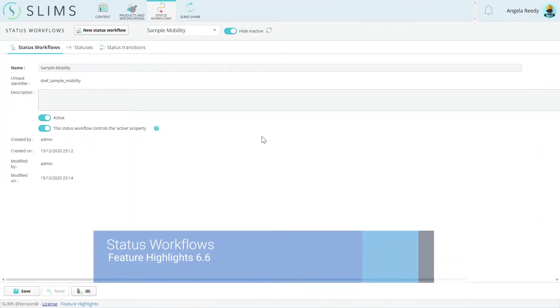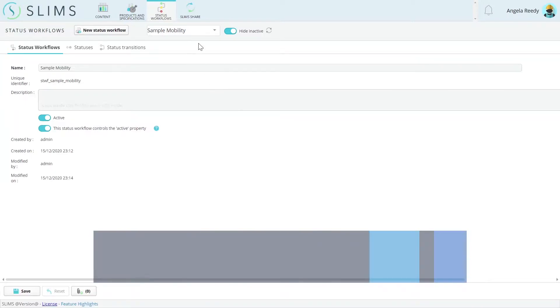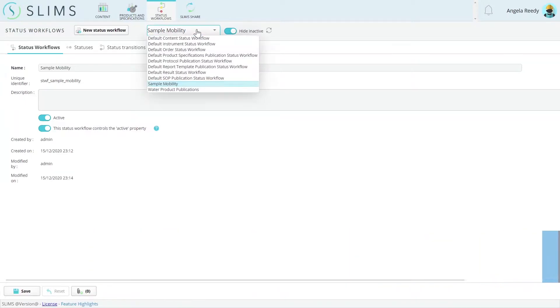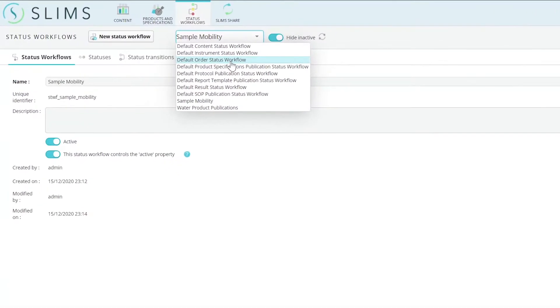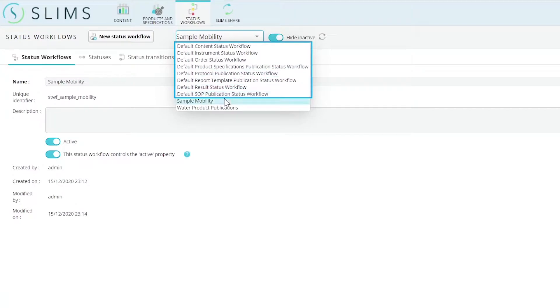The status modules in previous versions were combined into one, the new Status Workflows module. Several default status workflows exist to support standard statuses for various record types, such as content, orders, instruments, and more.